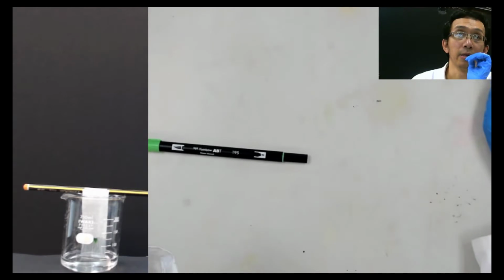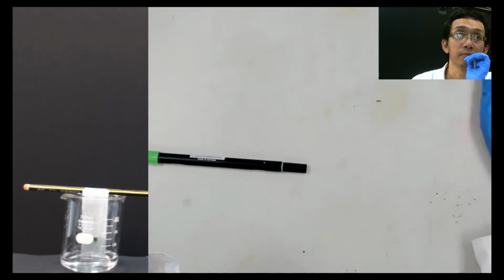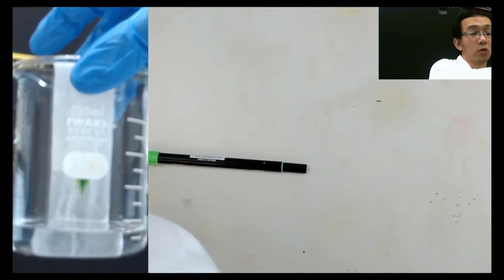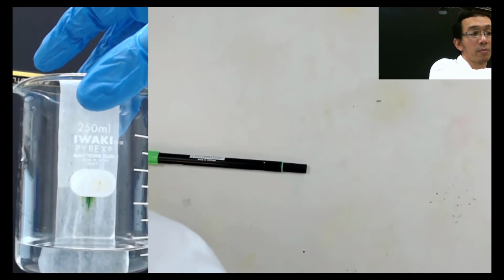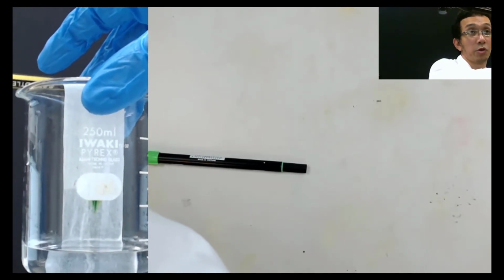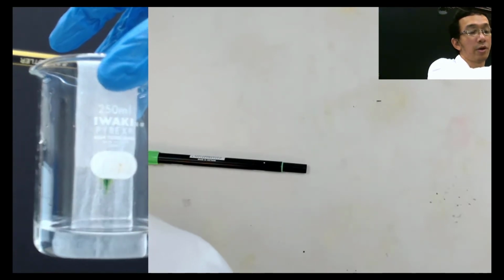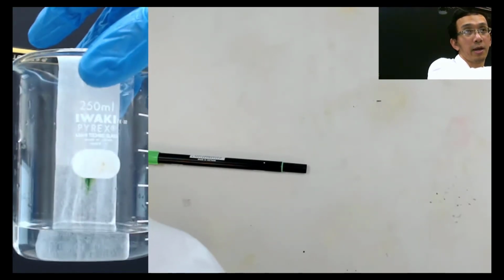Wait, let me zoom this thing. Okay, so you see the water is going up. Why is the water going up? So the question, anyone? Because of why? Why is the water going up? Question: give your name and answer.